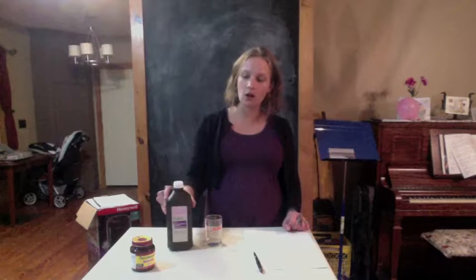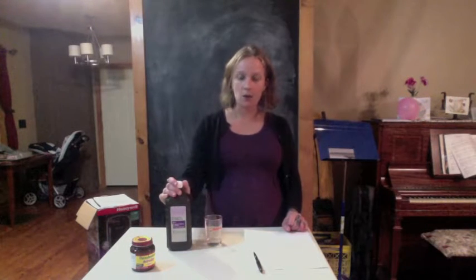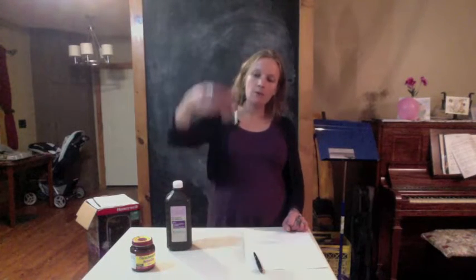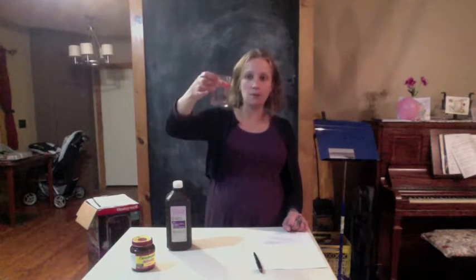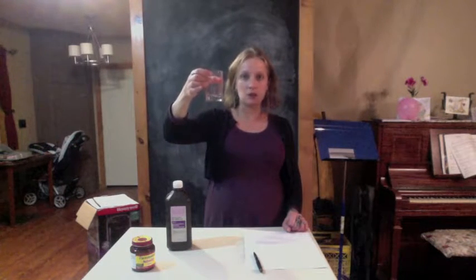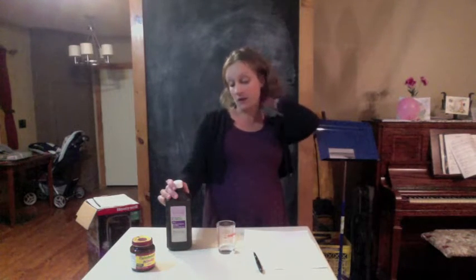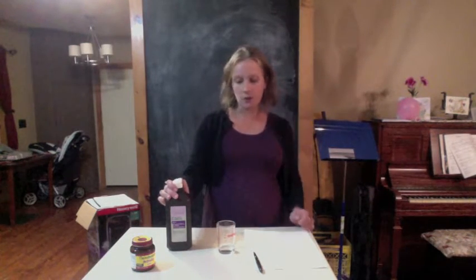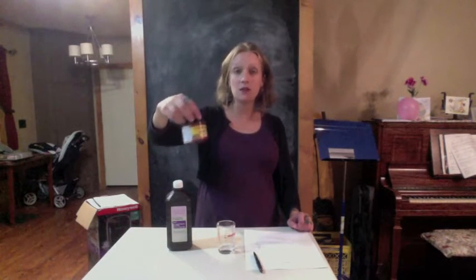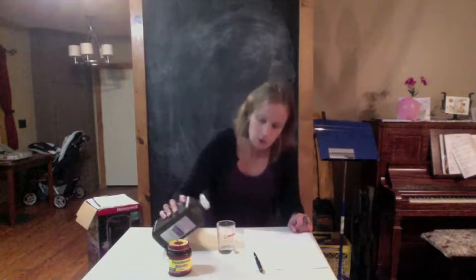Notice it's in a dark colored container. That's because light can also increase the rate at which it breaks down. So if I were to leave this in an open container for a long time, eventually oxygen molecules would be escaping and we'd be left with just water. However, we can't really observe that in front of our eyes. I'm not seeing any bubbles form. But if I add yeast, we may be able to actually see the reaction happen before our eyes because yeast is a catalyst.